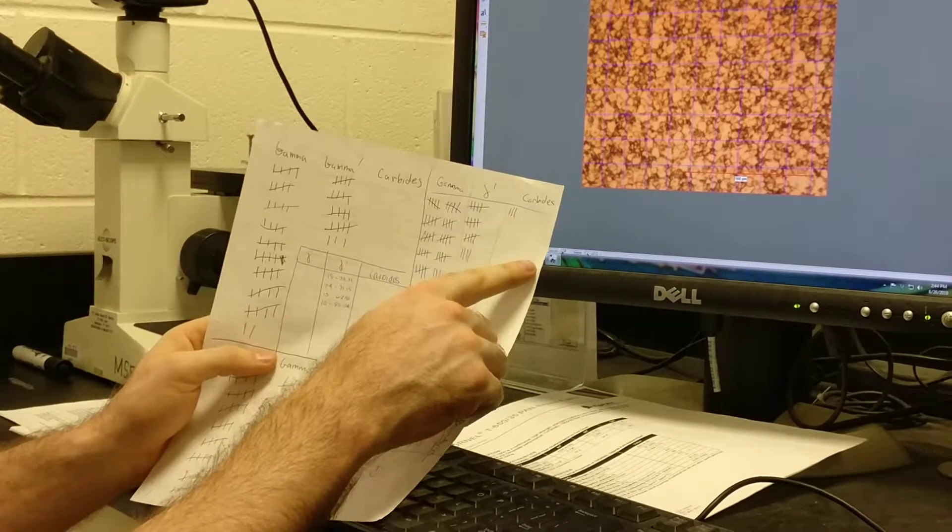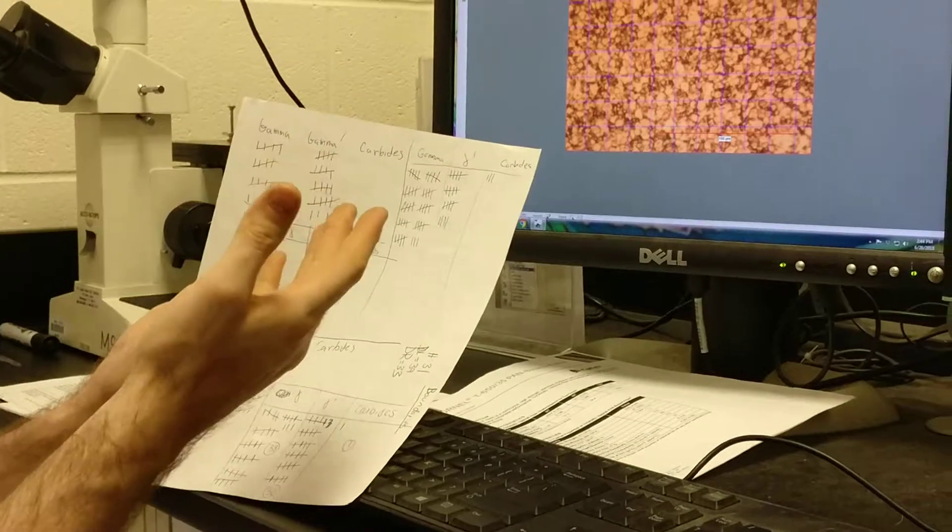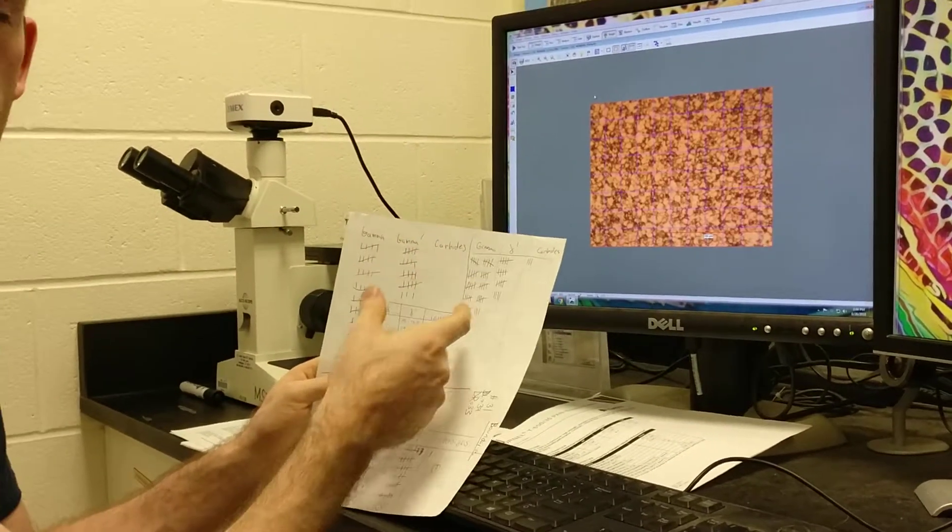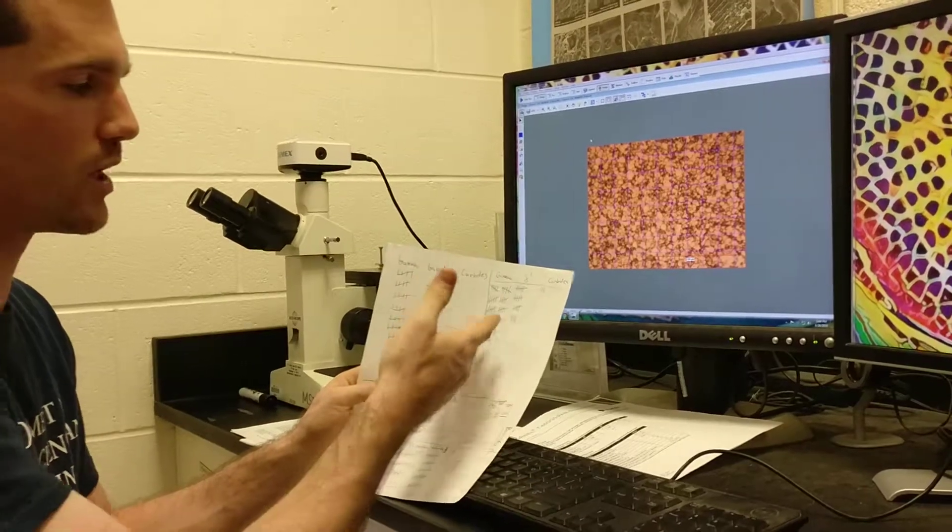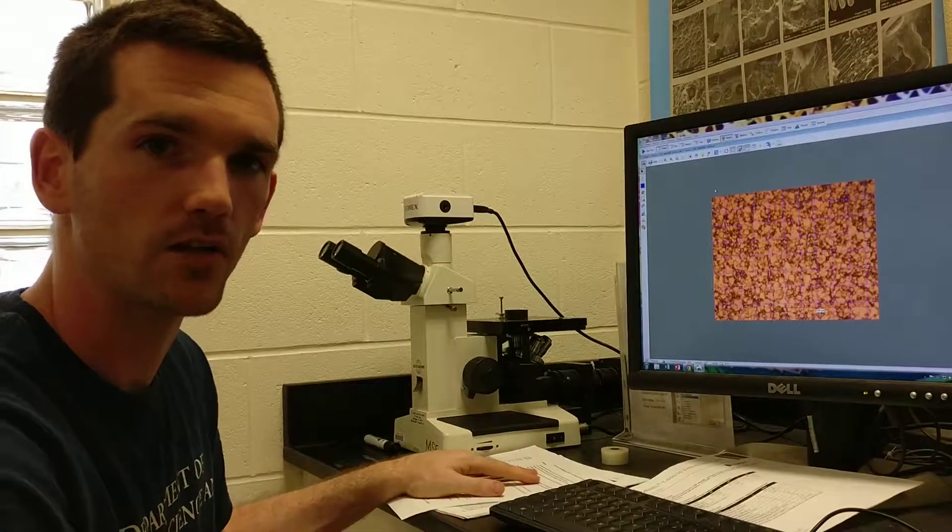We essentially will keep a tally list of each of the three phases that are in this material: gamma, gamma prime, and carbides. Then we'll note down tally marks for each intersection, which phase is that intersection in. We'll count those and divide each of those by 72 and we'll get a percentage for each of those phases.